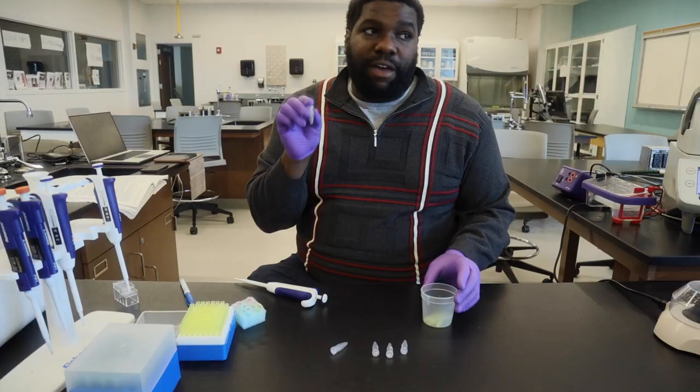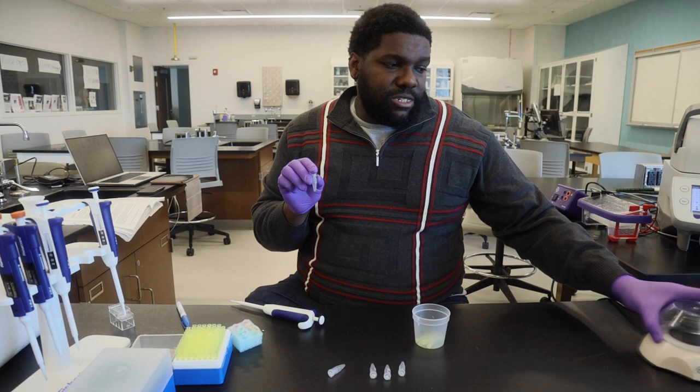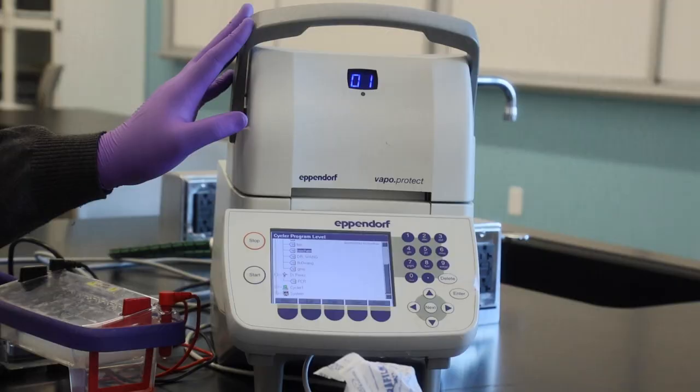After you've added all the DNA samples to all your tubes, we're going to spin down everything and then perform the reaction. After the solution is spun down, we're going to transfer the DNA over to the thermocycler to perform the reaction.